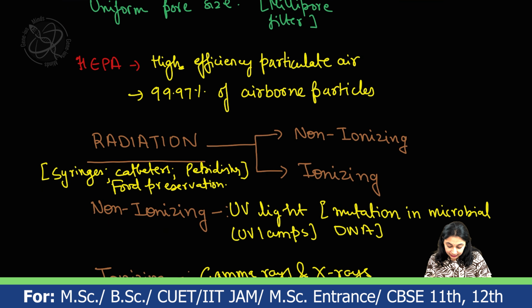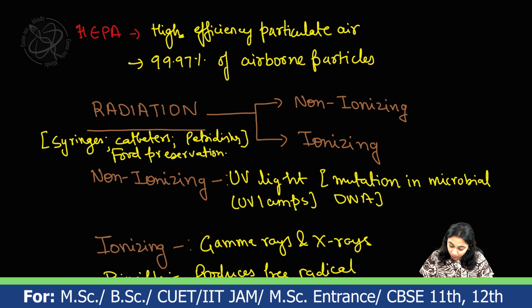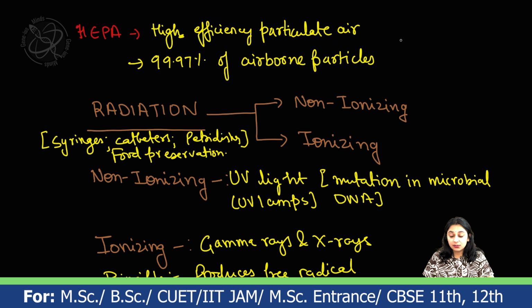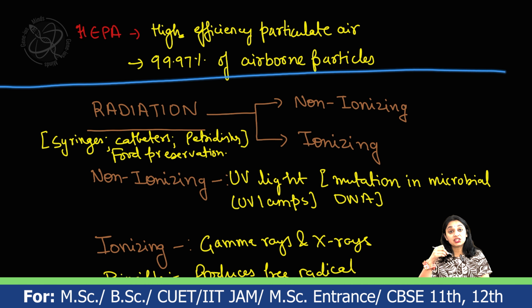Now the third category is the HEPA filter. HEPA stands for high efficiency particulate air filter. It is mostly used in the microbiology lab in the LAF, laminar air flow. It's an instrument where most of the work is carried out because it has the efficiency of removing around 99.97% of airborne particles. So this is all about the filtration methods.